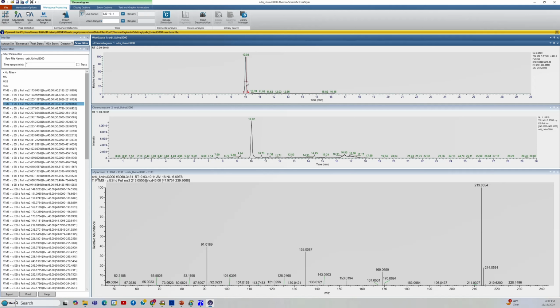However, if you try to take that to the NIST MSMS search, it'll lose the accurate mass here. So you don't want to do the average. If you just want to send it to the MSMS search, just left click on it, maybe in a couple of places just to see that it looks pretty much the same all the way through, and it does. So I'll just go to the top, and now I could send that to the NIST MSMS search.